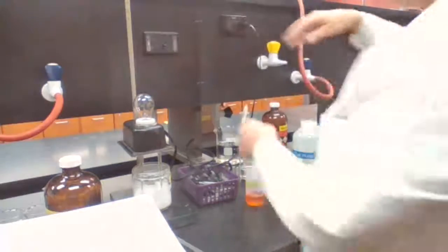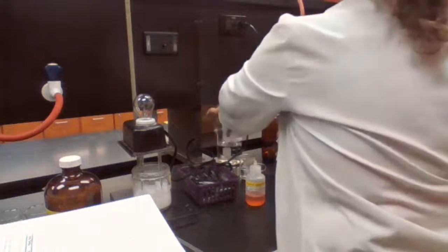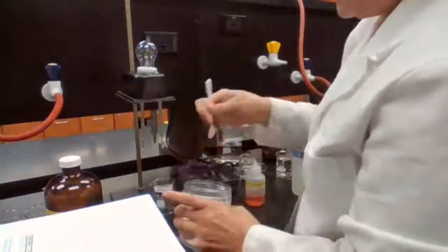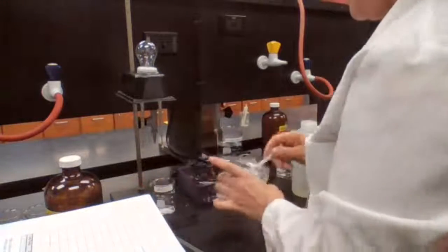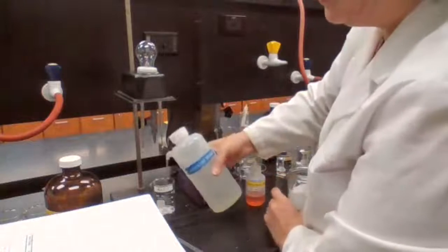Non-electrolyte, because there is no light, and because it's solid. Now, if we have NaCl in water, so basically we take the NaCl, place it in a beaker, and we add some DI water.